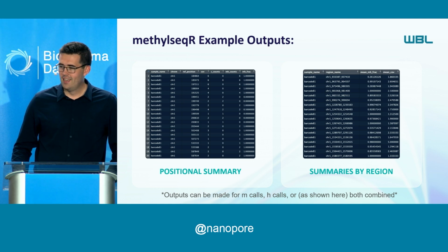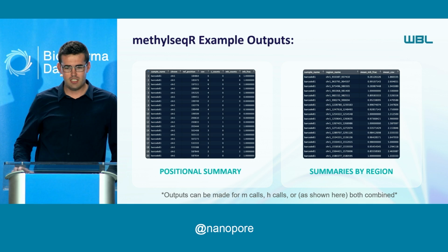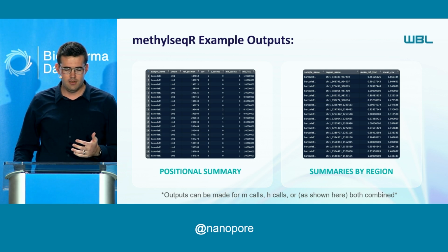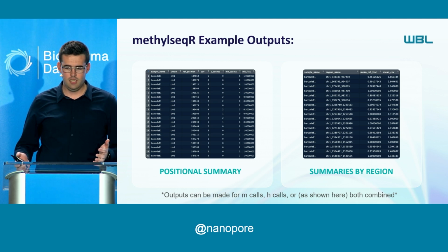One of the things that is in the background that a lot of people don't realize is we've designed this in a way that it can be run on any laptop. A lot of times when you're doing methylome-based stuff, it tries to burn a hole through your desk. And so all of these runs, these two runs specifically, were pushing 50x coverage, and they did an entire positional summary of all 28 million CpGs in a sample set of 100 in like 48 seconds. They were able to get the entire thing completed just on your regular M2 MacBook.